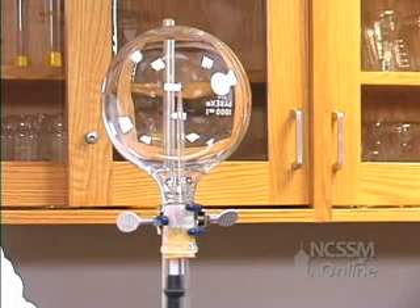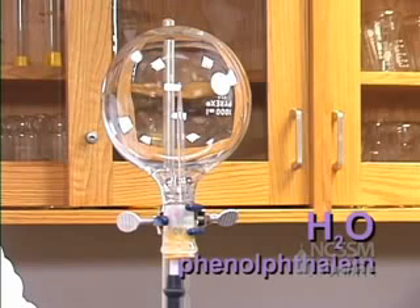We filled a one liter round bottom flask with ammonia gas. We're going to put in a medicine dropper that's sealed with a little bit of grease. The medicine dropper contains a small amount of water and phenolphthalein, which is an acid-base indicator.